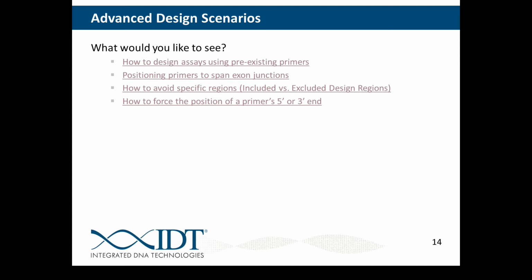So typically the TM you see on your spec sheet will differ from the TM you see on the design tool. To double check that, you can just hop into our OligoAnalyzer tool, input the sequence, use your default reaction conditions, and get an accurate reading of that TM.